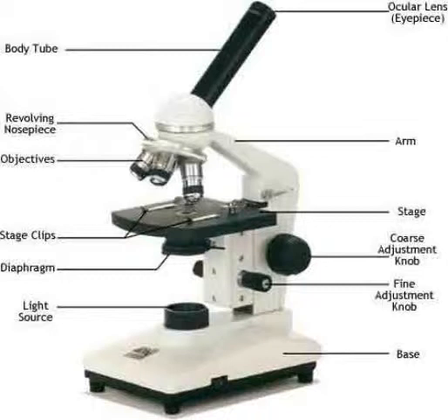Keep the lenses on your microscope clean. Never touch them with your fingers. If the eyepiece or objective lenses get dirty, clean them with a piece of lens paper moistened with alcohol. Wipe the lens in a light circular motion and change the lens paper as it picks up the dirt. Make certain that you leave no streaks on the lens. Note, cleaning the lens with anything other than lens paper or wiping too hard will scratch the lens.